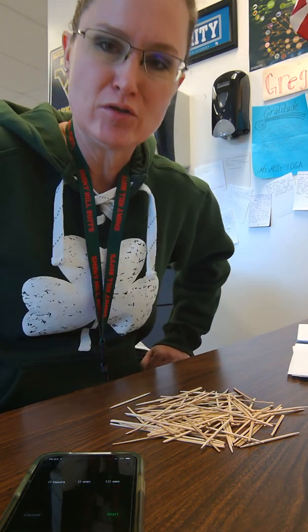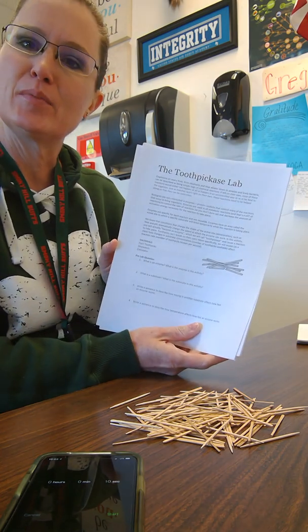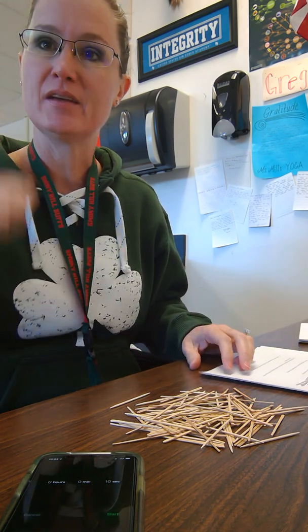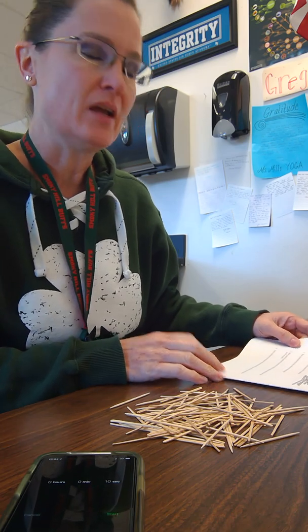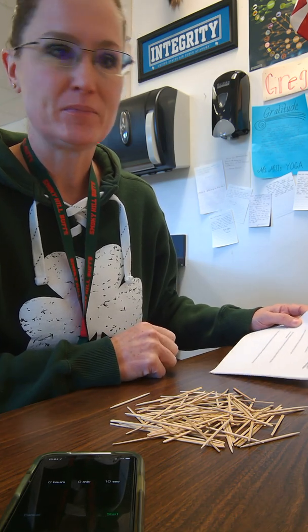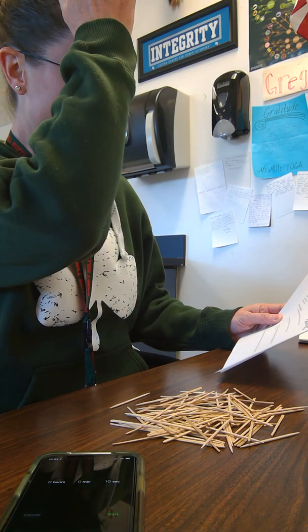Alrighty guys, so I'm going to show you the Toothpickase Lab. It looks like this. I'll put it on my Schoology page, so you just need to have that. I will make it into a Google Doc so you can just put your answers right on that and then share it with me, and then I'll just grade it. So this talks about enzymes, and it's just a simple little, silly little example of reactions and stuff like that. And so you can read through the top part.